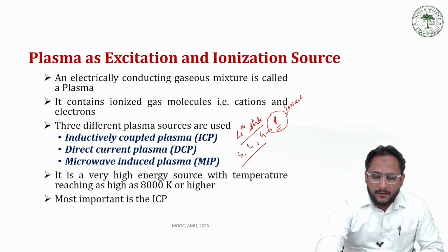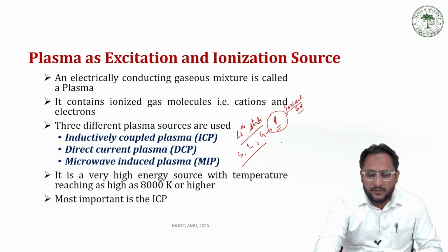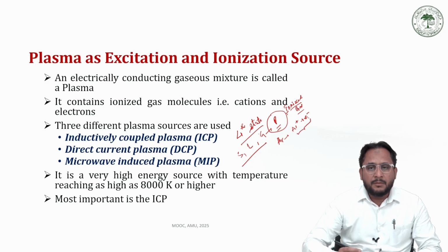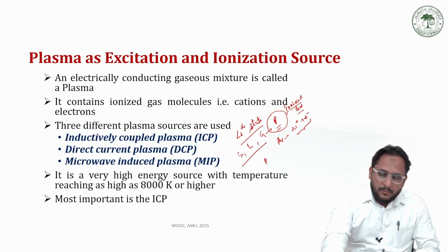Ionized gas is present in plasma. So when a gas is heated at very high temperature, so that the gas is ionized, for example, if an inert gas like argon is heated at very high temperature, it forms Ar positive and electrons, then this will create a plasma. Then the fifth state is called Bose-Einstein condensate, which is a very low temperature state.